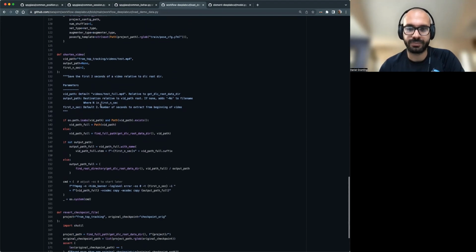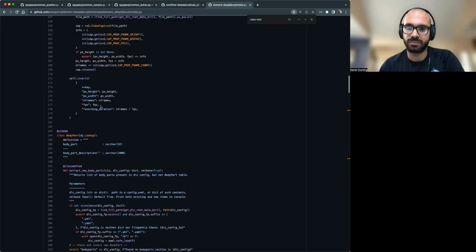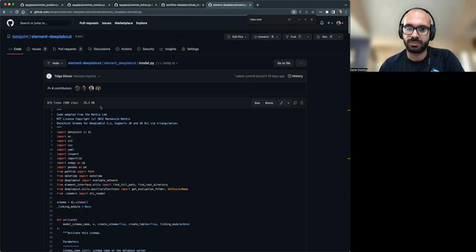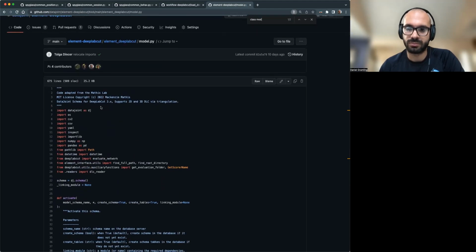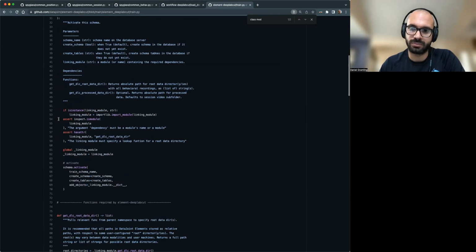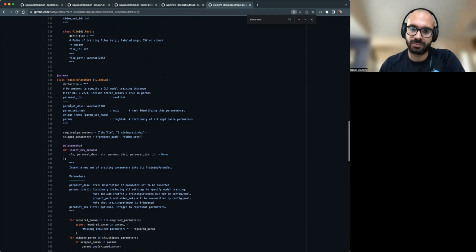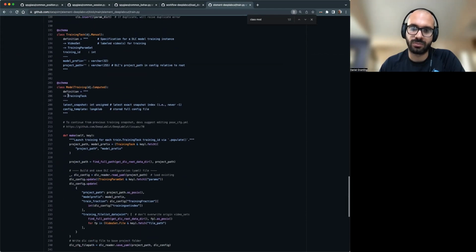Gotcha. So there's a subset that's here. As far as how to hook that information into the pipeline, my first instinct is that yes, you would need to fork it and then add a dependency somewhere in the train schema that says this training param set belongs to this project, or maybe this model training table belongs to this project.